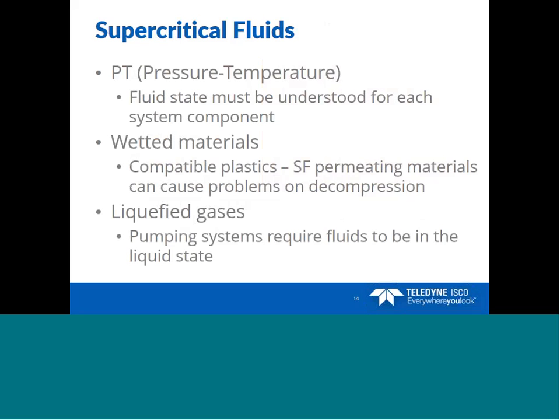When considering the system components for supercritical fluids, you need to understand the fluid state at pressures and temperatures for each system component, that is, at each point in the system, is it either a gas or a liquid. You need to understand the wetted materials and whether they are compatible with CO2. Incompatible plastics may allow the supercritical fluids to permeate the material and then cause problems on decompression. Also, the pumping system requires fluids to be in a liquid state in order to pump properly.